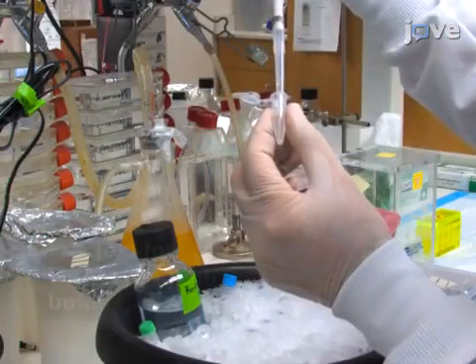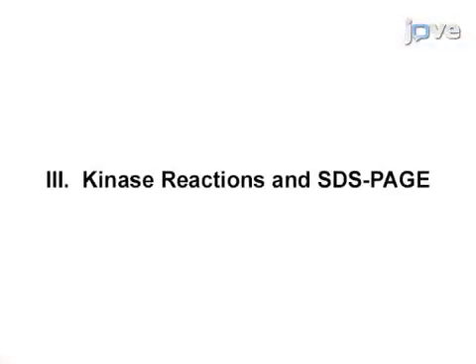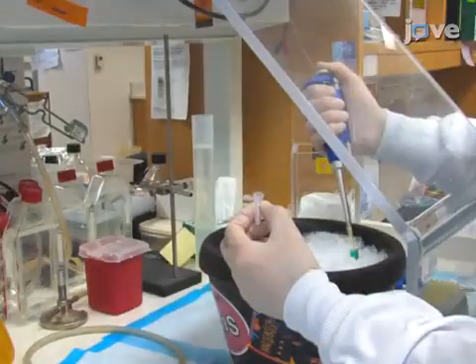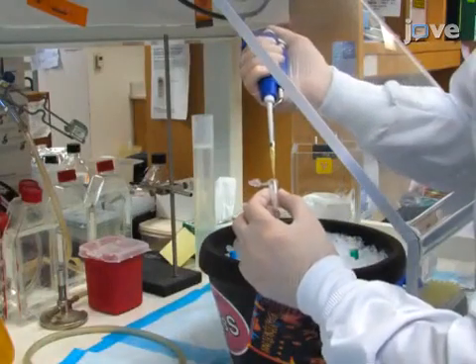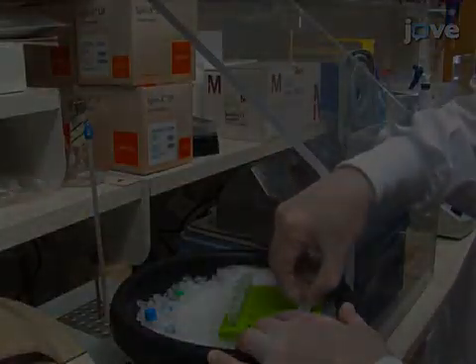After touch spinning, remove as much buffer as possible without removing the beads. To initialize the assay, add the entire reaction mixture to the kinase sample and incubate the reaction for 30 minutes.